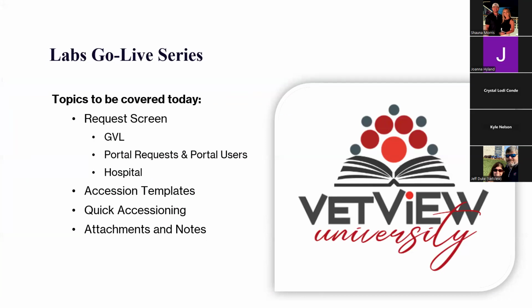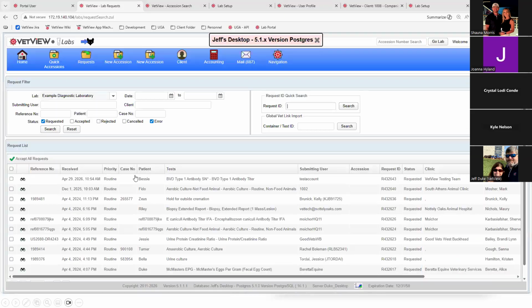And again, there is an interface that lets you have other sources. There is one that we're working on currently for a lot of y'all on the call, for EasyVet, that will be one of the ones on the list. It'll actually be what I'm calling hospital here. That will be your EasyVet connection to your teaching hospital that you were connected to. But you can also do portal requests from maybe referring veterinarians as well. But the three main sources here.